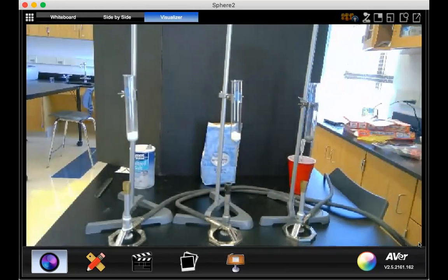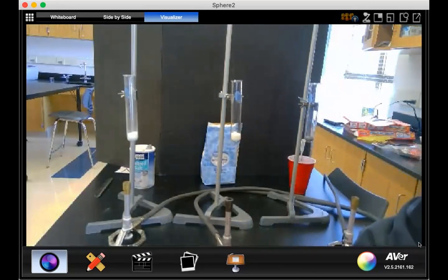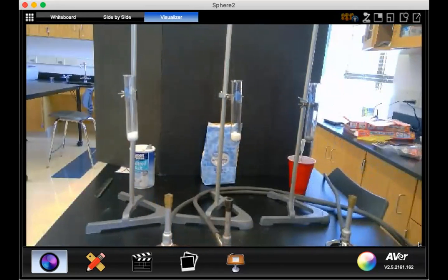We'll try to keep all of them about the same height over the Bunsen burners' flames. Now the Bunsen burner flames, I want to keep those pretty consistent too, so we can see if there's a big difference in how some react. You know, we're not heating one up a lot differently than the other ones. And so I'll light up my Bunsen burners. Turn on my safety goggles.